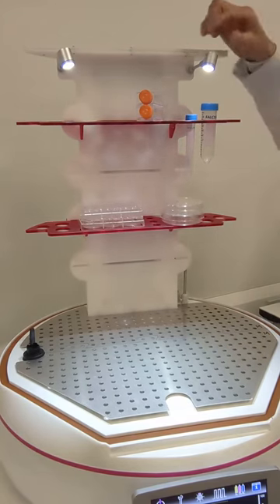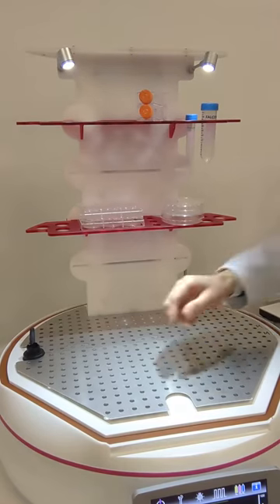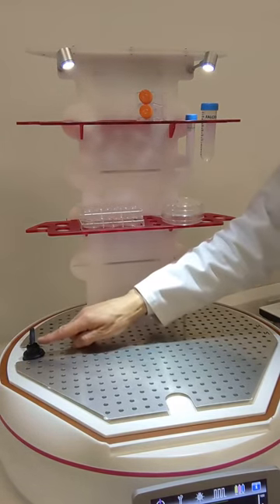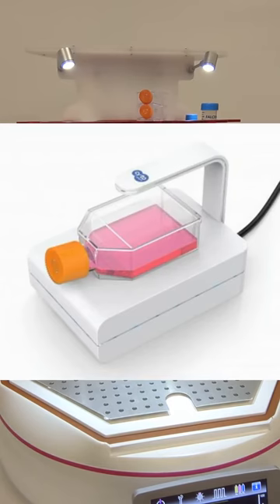We find 2 adjustable LED lights, as well as a dedicated USB port to support the CytoSmart Lux 2 microscope for real-time and/or time-lapse imaging of cells in culture.